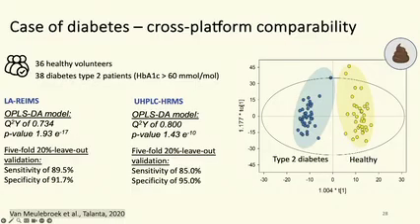Now, going to human samples and biofluid applications, one of our first proofs of concept was within the diabetes study, when we collected fecal samples from people with normal glucose levels and people suffering from diabetes type 2. And we did fingerprinting, and we saw that fingerprints collected from REIMS and UHPLC, so conventional LC-MS platform, are quite comparable within their classification performance.